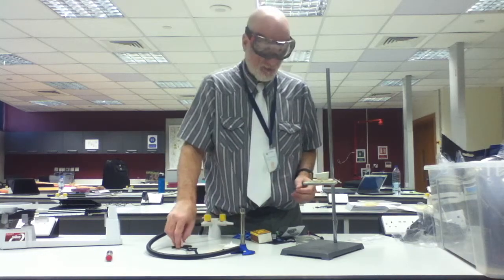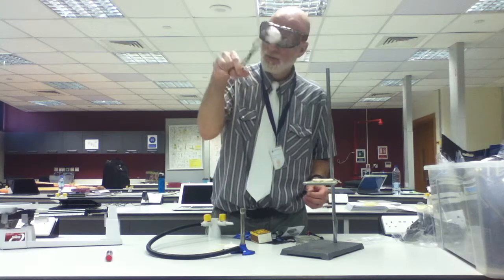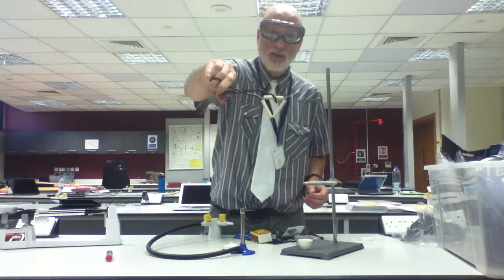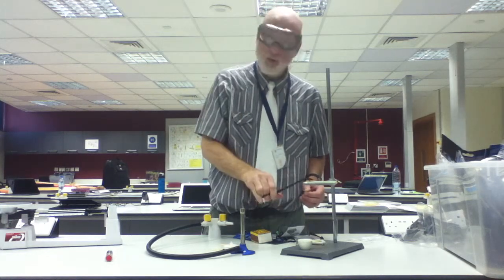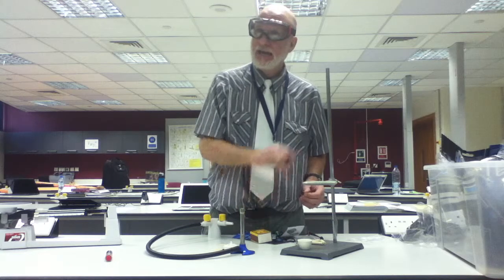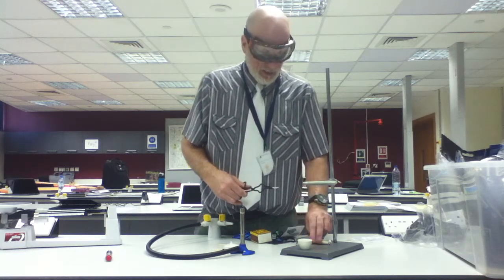Let me take this off. The crucible tongs, these are called. Clay triangle. Can you see it? Clay triangle. Okay. Ring. Got it? Ring stand. It's called a ring stand. Okay? All right, so, ouch.